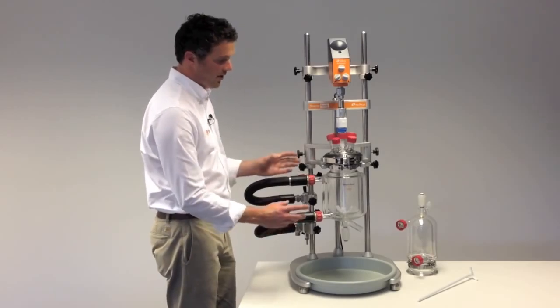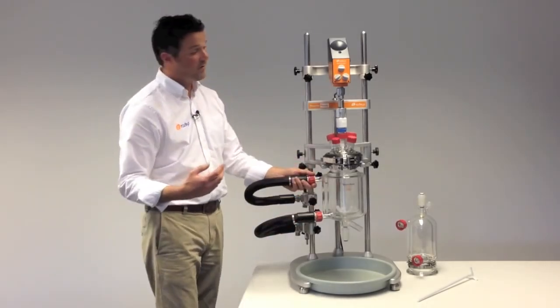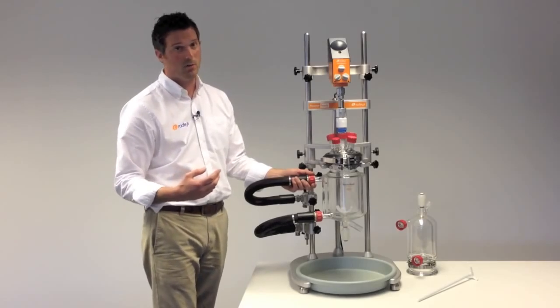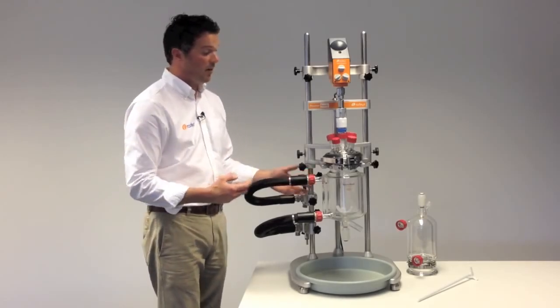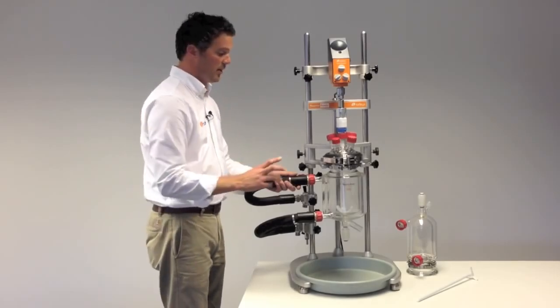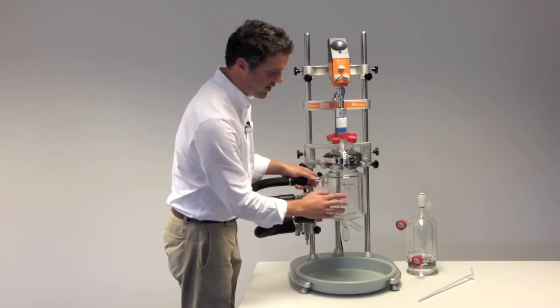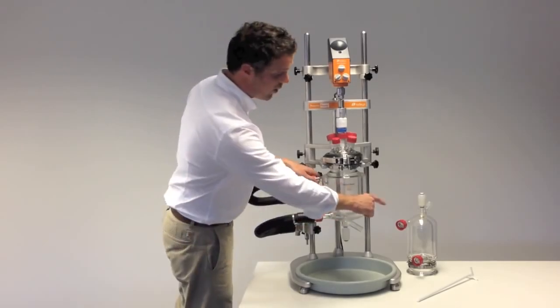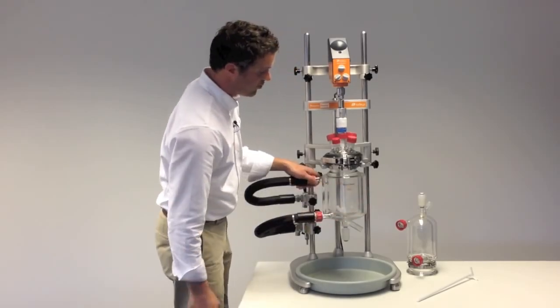The idea of the design is that you can change vessels or remove vessels really quickly and easily without tools or mess, and you can change your vessel in minutes rather than hours. The best way to show you this is for me to change from this 2 liter process vessel to the 1 liter standard geometry vessel.